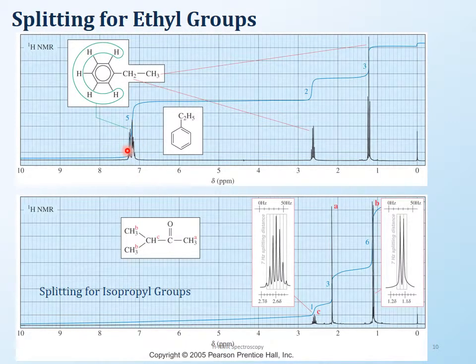In some cases you will see very nice splitting even for the benzene ring, and if we come across one, I'll show it to you. But otherwise, benzene ring protons can usually be a mess, and that's why they're called a multiplet. So for ethyl benzene, you will have 3 signals: the multiplet, the quartet and the triplet.